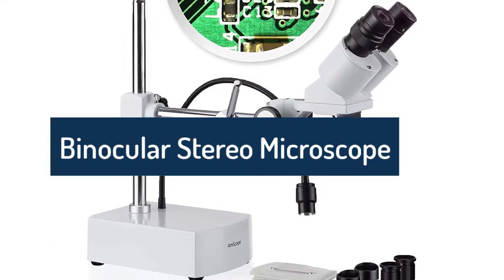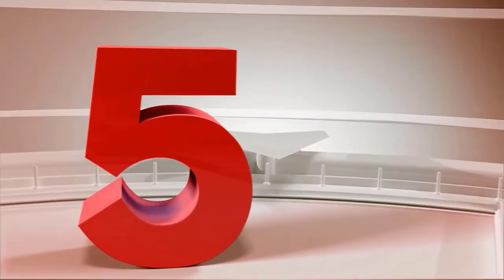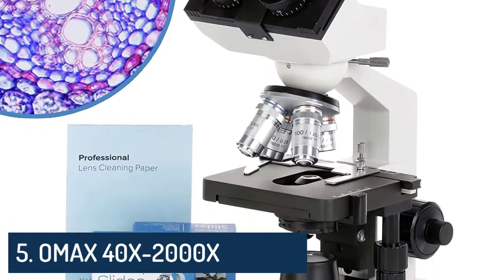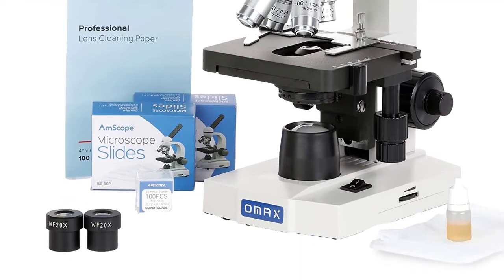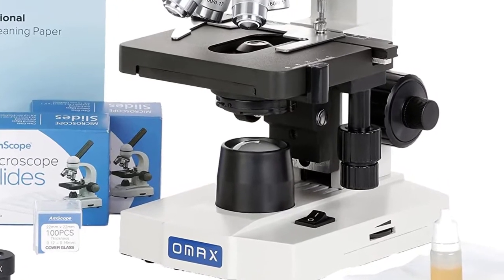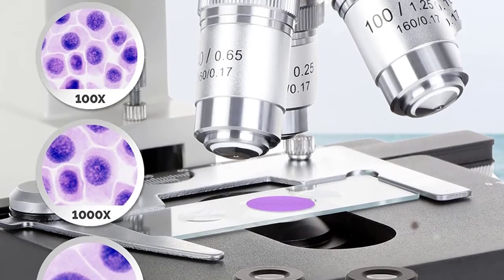Top five best microscopes to buy in 2022. Number five: Omax 40x-2000x LED binocular compound lab microscope with double layer mechanical stage, plus blank slides, cover slips, and lens cleaning paper.